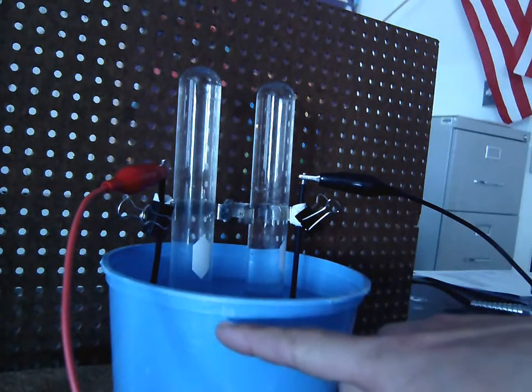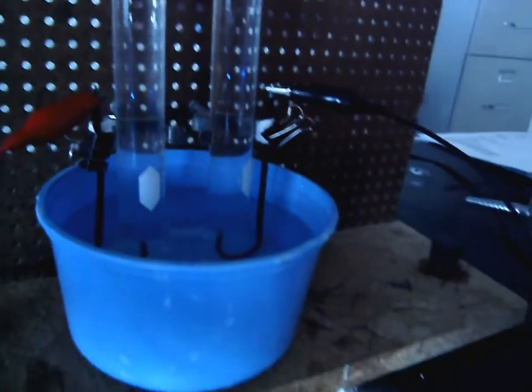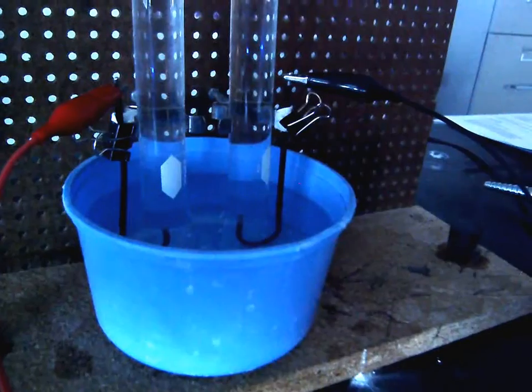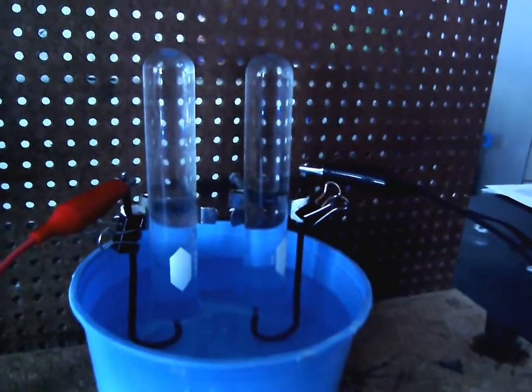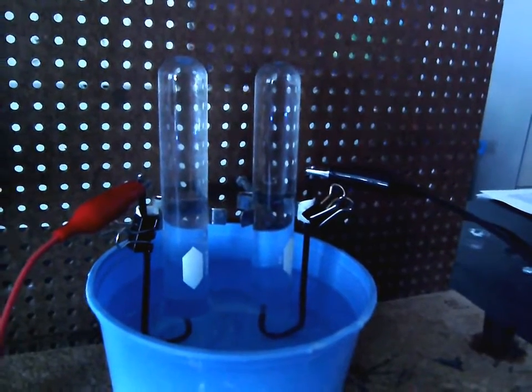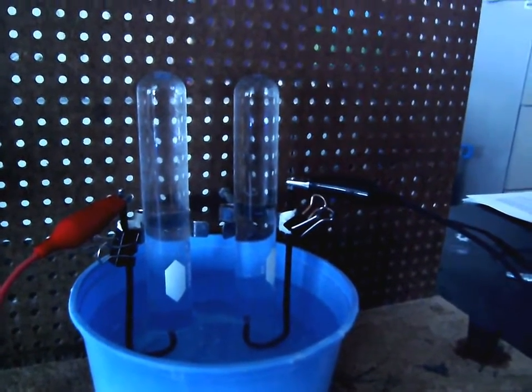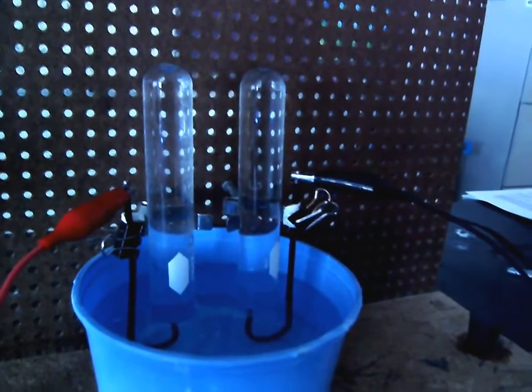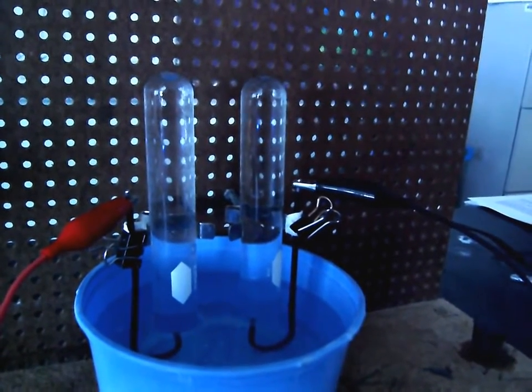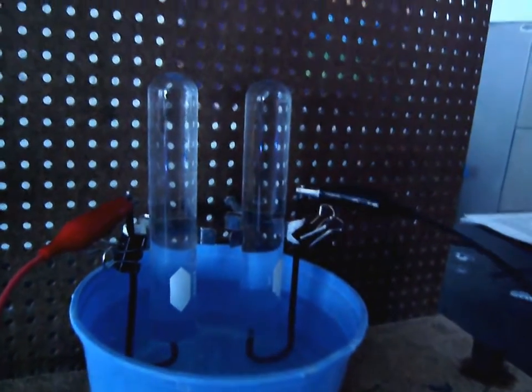Right here we have a bucket of water, and I'll try to move this so you can see. There's water inside that bucket. And then we have these two test tubes right here that are turned upside down. What you can't tell just yet is that there is water filling those test tubes. Those test tubes are full of water with the mouth of the test tube underneath the surface level of the water in the bucket, so that the water in the test tubes can't spill out.